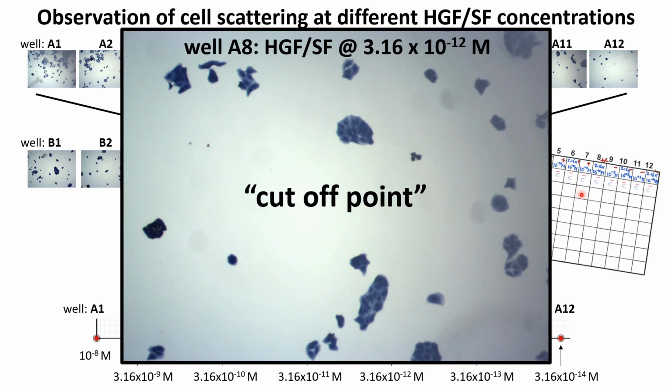we have to understand that maybe someone will say, no, this to me already looks like negative. It's a non-quantitative assay.